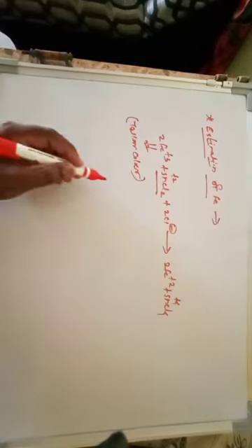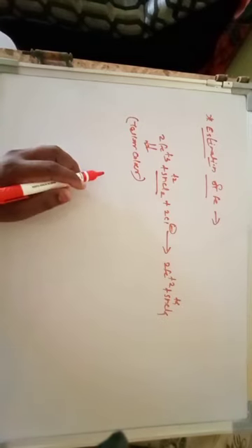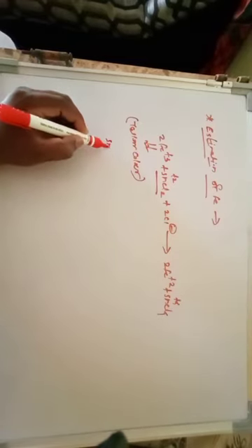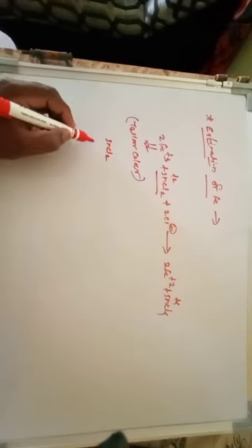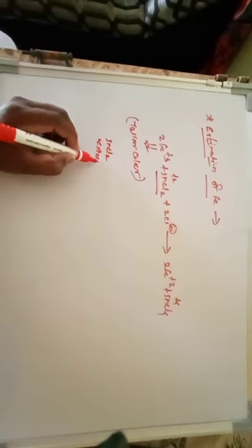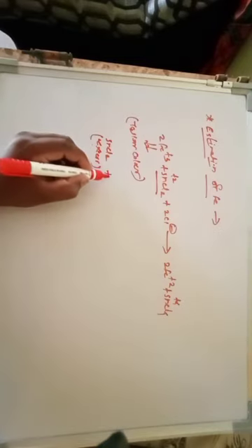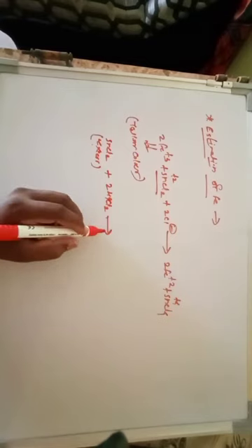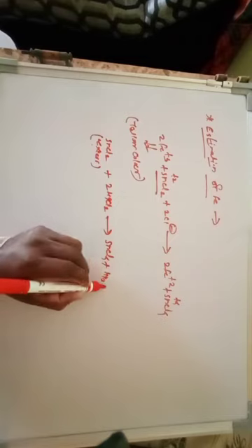So the excess tin chloride, SnCl2, which is present in your solution is removed by the addition of HgCl2, mercuric chloride, and there is a formation of SnCl4 plus Hg2Cl2.